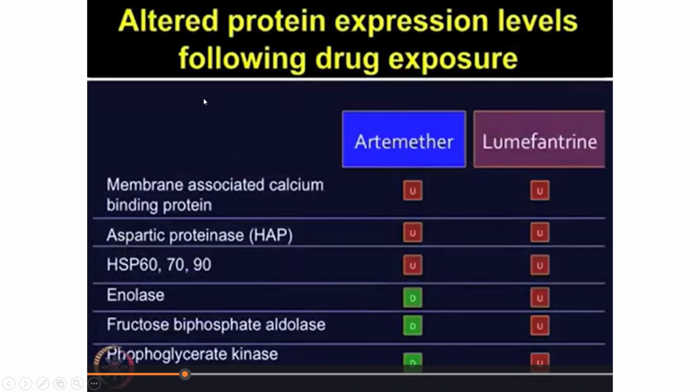So altered protein expressions were observed following drug exposure. With this drug exposure, these were proteins which were upregulated, and these were certain proteins which were downregulated with this drug treatment, whereas it was upregulated with this drug treatment.